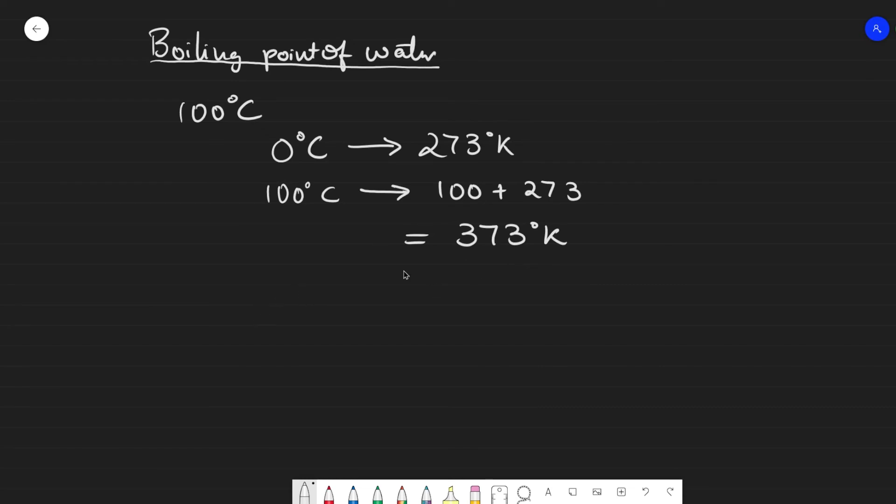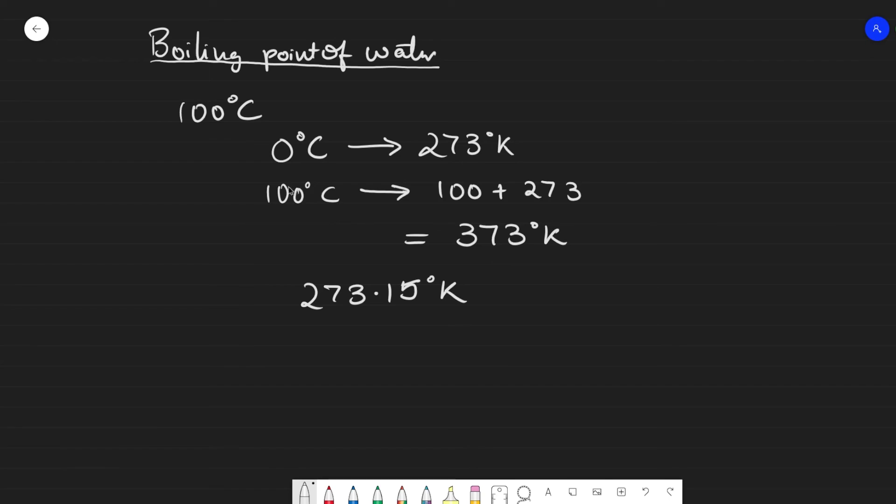You can also be more precise and use a more accurate value of 273.15 Kelvin. For example, on the day you conduct the experiment, you might not get an exact 100 degrees Celsius.